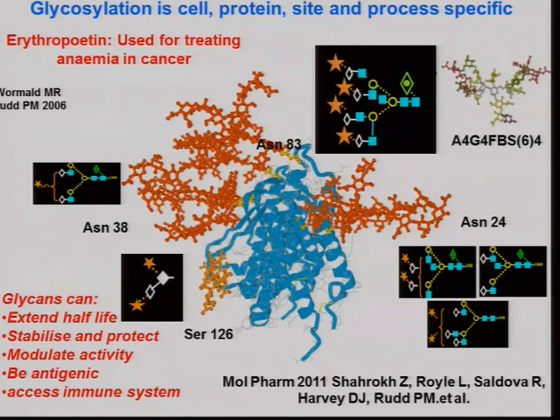What is a good threshold to start to quantitate peaks? In a profile there are many peaks, and for example in IgGs, four peaks are the major structures, but in mice, in rodents, there are many other peaks in minimal amounts. Which is the last peak you quantitate? Well, we would determine any peak we can see, and we would normally go down to 0.05% of the total glycans. That's what we can analyse quantitatively with confidence. If you're looking at something for the first time, you probably want to do that. But if those peaks are not critical features, and you don't need to know those structures every time, then you might just decide to go for the top 20 or so. It's a judgment how many you would look at. But if we can see it, we do analyse it.